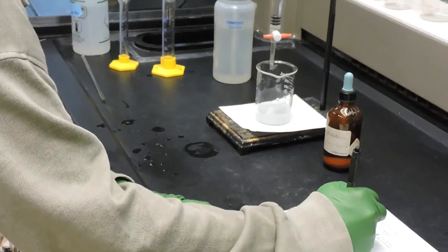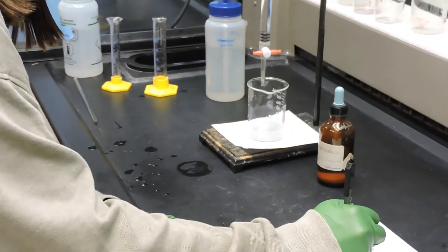The initial volume of the burette for trial two is the same as the final volume for trial one, which is 10.51 milliliters.